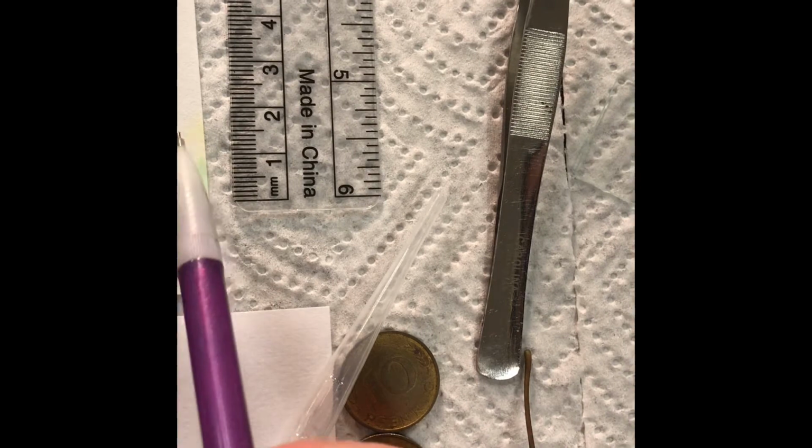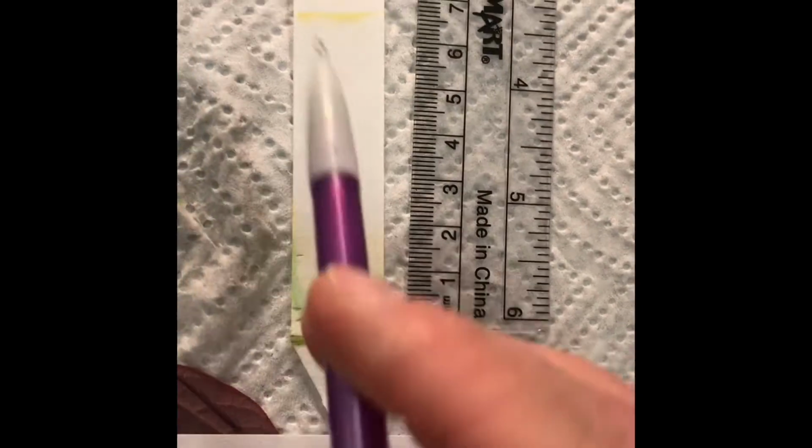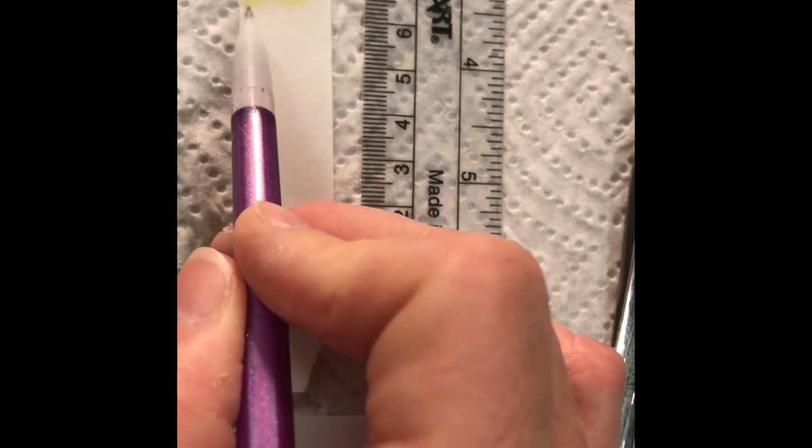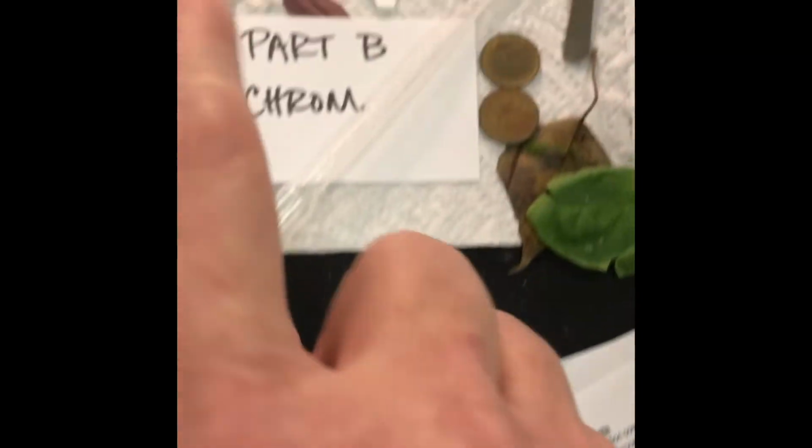Do y'all see this one right here? Yes, ma'am. So that one will be about here, and then the one up here, that's your last pigment. So you mark that. Okay, so now according to the formula, you want to count from your origin to the base of each of those pigments and then record that in your data table. All right, so we're going to calculate the distance from the origin to each pigment. So my origin is going to be right here, the base of the pigment, and we're going to count up to the first pigment line.